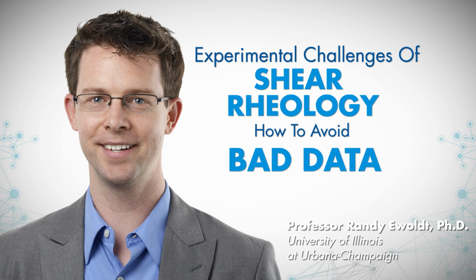In fact, your comments on surface tension lead nicely into a couple of questions that we've had on the topic of surface tension, especially in rotation. The primary examples that you gave regarding artifacts related to surface tension were for water, which has a high surface tension. So one, do you expect a similar effect with lower surface tension fluids such as organic solvents? And two, have you considered a flooded geometry that could perhaps address potential surface tension issues, but maybe raise some other issues? Do you have any comments on whether a flooded approach might be a suitable way to address those things? Yeah, those are fantastic questions.